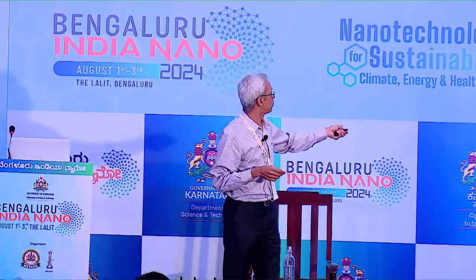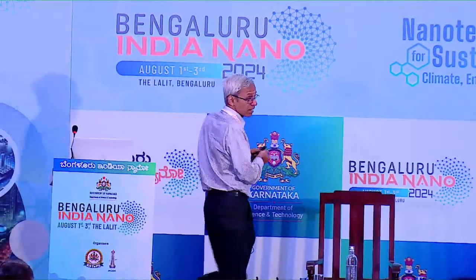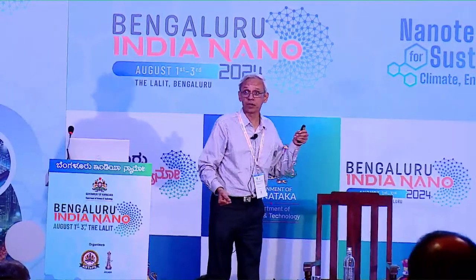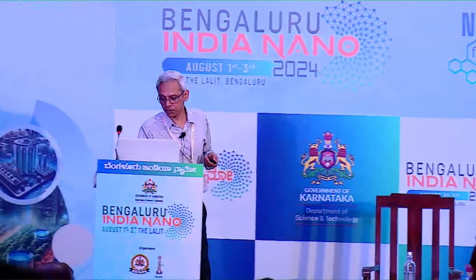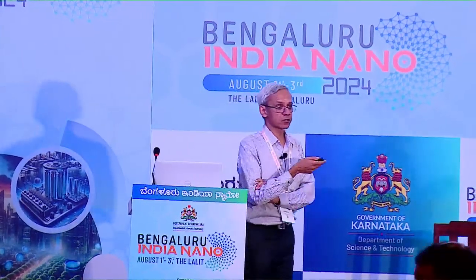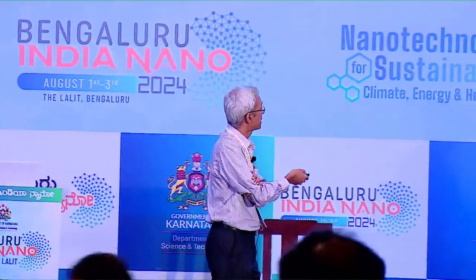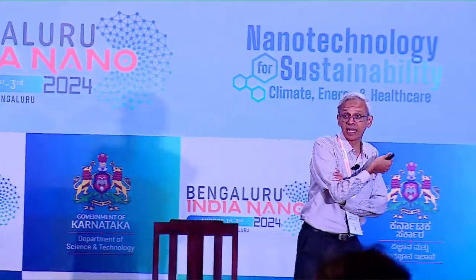This is a 1.25 million volt electron microscope, which means you're accelerating electrons to very high energies, and that's basically used for studying electron damage of materials and so on. There are multiple things. These are the modern generation microscopes, the current state of the art. I'm just giving you 2 examples; there are others from JEOL also, for example. These are the aberration corrected microscopes. I will give you several examples of what we can get.